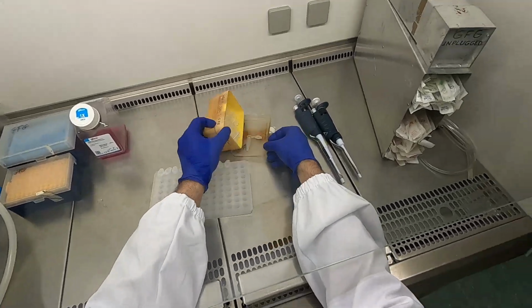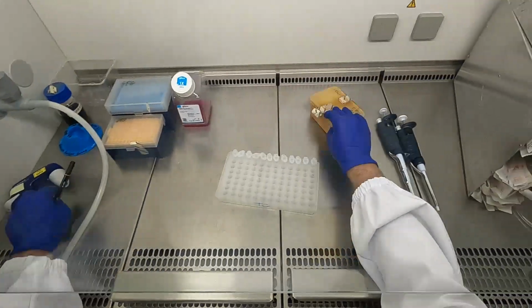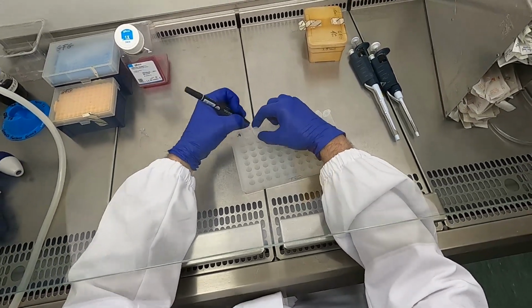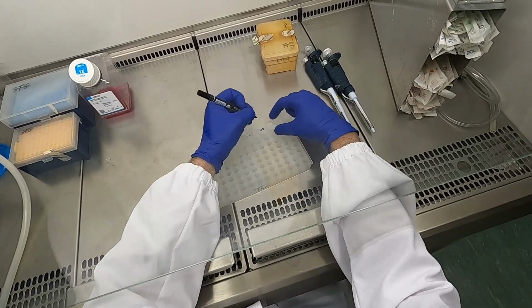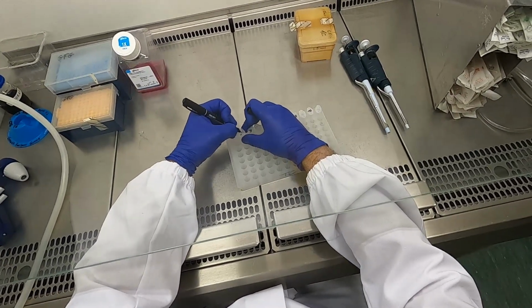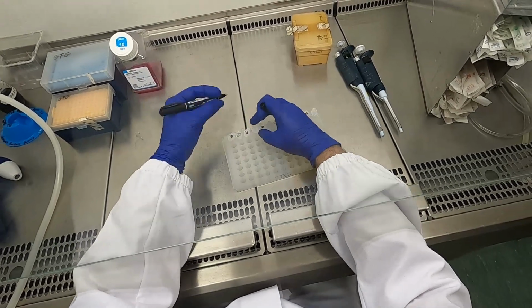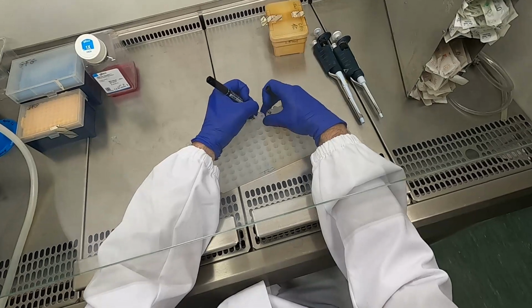We do not touch the caps, we do not touch the inside of the tube, because even though you're wearing gloves, those gloves are certainly not clean anymore, because you're touching all sorts of surfaces that are not sterile, and it's very easy to introduce bacteria if you're not careful.